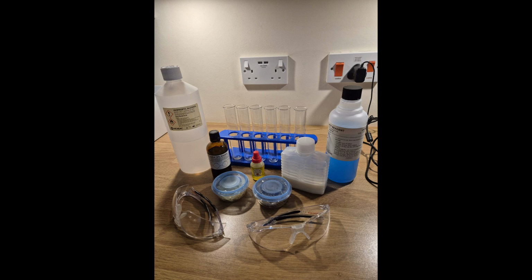Today we are going to be testing different types of food to find out what nutrients they contain. There's a picture on the screen of 3 test solutions in bottles and 4 different types of food in pots and bottles. You can also see 2 pairs of safety goggles and 6 boiling tubes in the same blue holder that we used when we were making our video about enzyme activity.